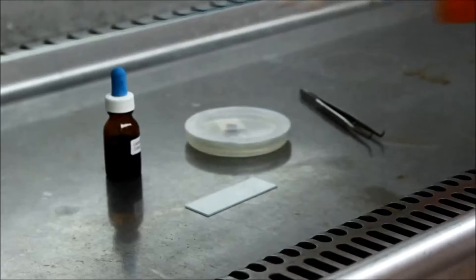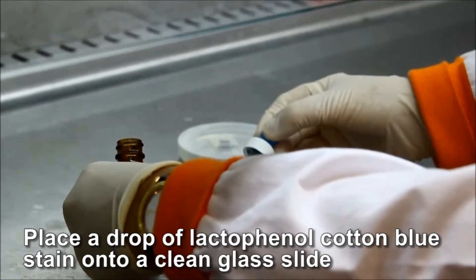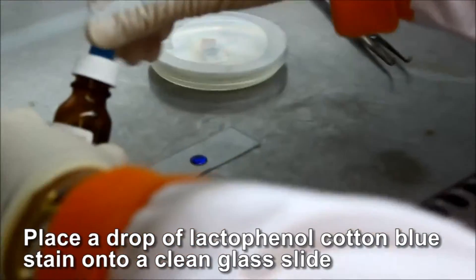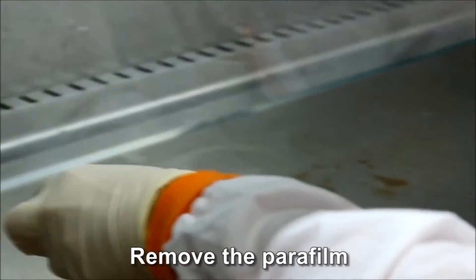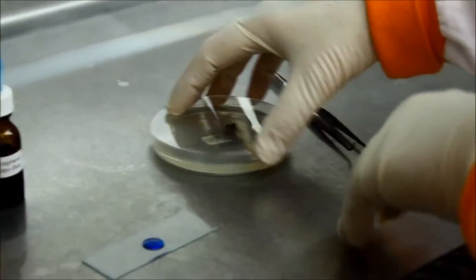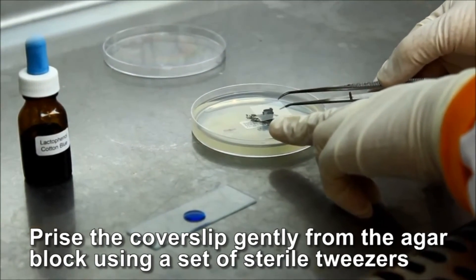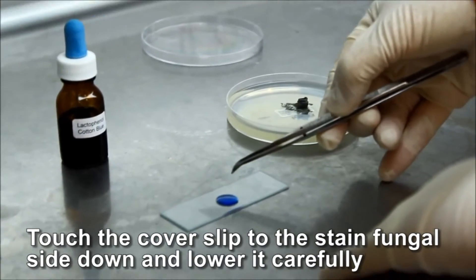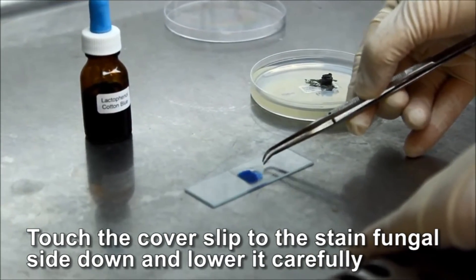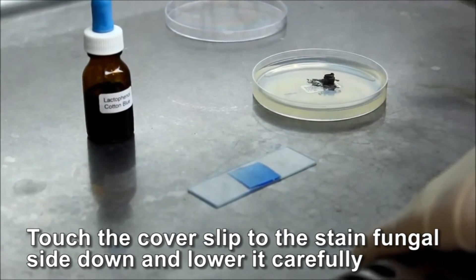Staining the coverslip with lactophenol cotton blue. Working inside a biological safety cabinet, place a drop of lactophenol cotton blue stain onto a clean glass slide. Remove the parafilm from the plate and dispose into the appropriate waste container. Prise the coverslip gently from the agar block using a set of sterile tweezers. Place the coverslip by touching it to the stain at a 45-degree angle, then carefully lower it onto the slide, taking care not to form bubbles.